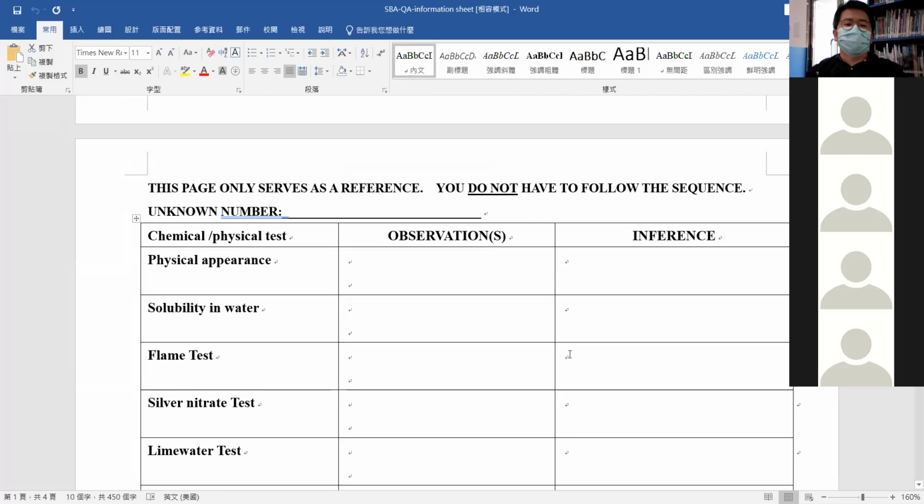This is the lab sheet. You need not follow the sequence. Remember, the logical deduction does matter. You are given limited time to arrive at the answers as quickly as possible. So you need not follow that step by step. You have to think of the schematic flow in coming up with the deduction, to know the identity of the cations and anions.